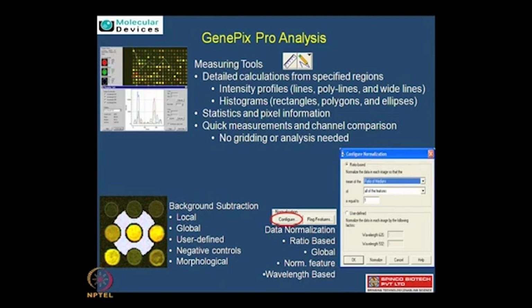And we also have a global background. At any other place, or hole in the chip where the spot is not present, the different background levels can be calculated at specific positions. Now this can be used to calculate the global background corrections.